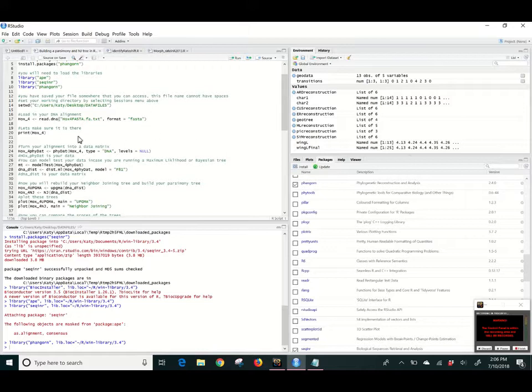All right, next we're going to call up our file. This, honestly, is one of the hardest parts of R. It's just getting your file into R and making it an item that R is using. Once it's in there, it's no big deal, but getting it in there is kind of a pain. So we're going to do it like this. You can, again, either select this and hit run, but I don't want to do that because I want to show you how to do it. So we're going to type down here in this window.